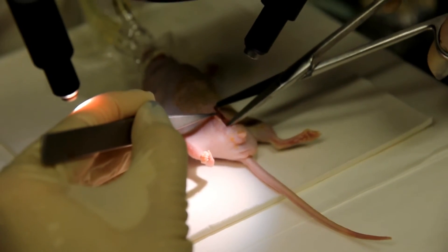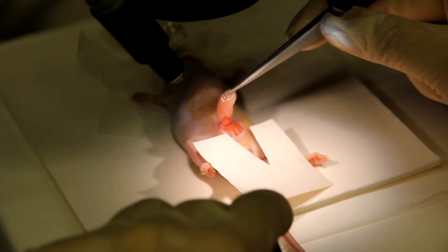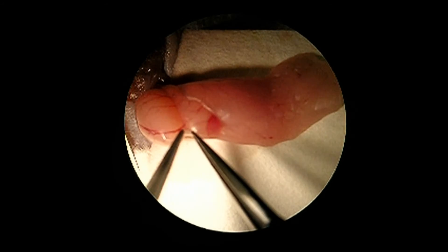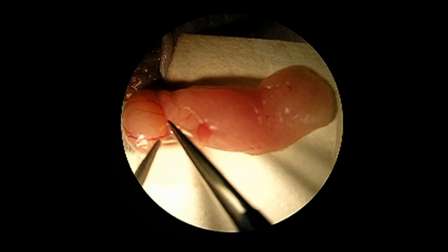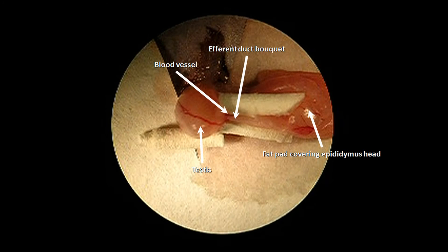Perform a 1 cm length incision on the linea alba. Retrieve the first testis carefully by pulling out from the fat pad surrounding the epididymis. After this, use sterile V-cut paper pads to deposit the gonad. Use fine forceps to dissect the membrane connecting the caput epididymis and the apical part of the testis. If necessary, carefully peel out the fat covering the efferent duct bundle in order to visualize it clearly, with special care to avoid breaking the blood vessel under the efferent duct bundle. Sterile paper sponges can be used to position the testis, efferent duct, and epididymis and to absorb excess fluid. Here you can see the testis in upright position on the left and the efferent duct bundle aligned with the injection pipette that will enter from the right side.